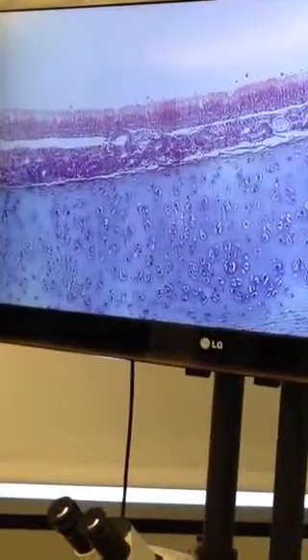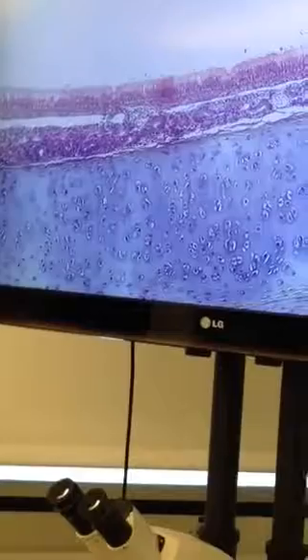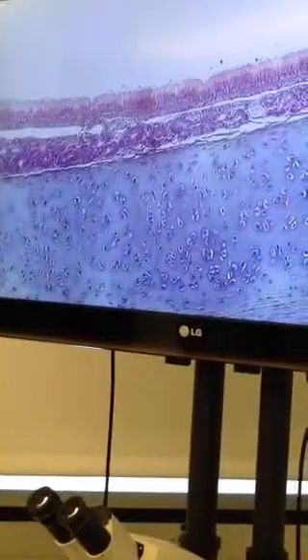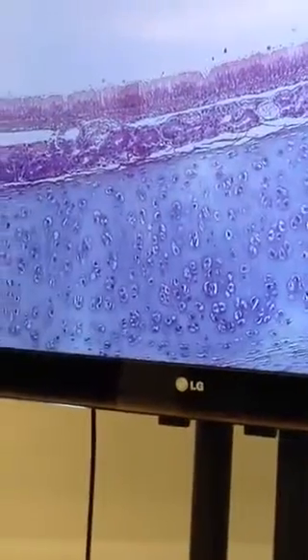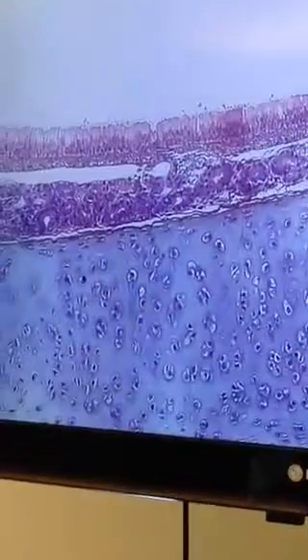There's just 2 slides for this, although just to give you a warning for what's to come, for the digestive system, there's so many slides. There's a lot. But for the respiratory system, it's not so bad. It's just the trachea, this is the trachea, and the lung.